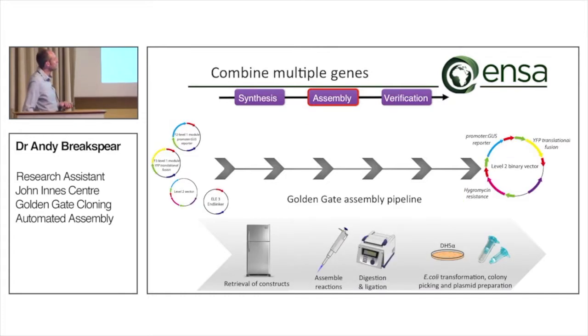So the technology that underpins this is actually really basic, and it consists of a freezer to store your modules, and you have a pipette and a thermocycler to carry out the reactions. And then there's a bit of basic microbiology to propagate the plasmid and then extract the plasmid.